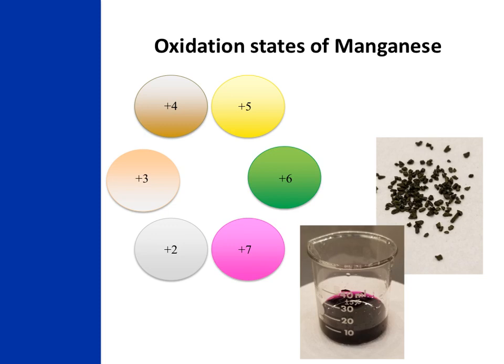The green manganate ion in the +6 oxidation state is only stable in basic solutions. The +5 oxidation state produces a yellow or sometimes blue color, depending on the pH, while the +4 oxidation state often forms a clear solution with a brown precipitate. The +3 state will form, in a slightly basic solution, a peach color, while the +2 is a clear solution without a precipitate.